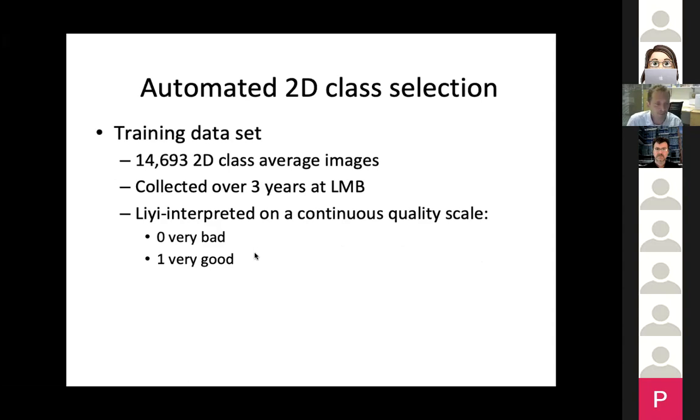Many people clicked yes, and then the 2D class averages and all the metadata from RELION Refine that led to that classification were copied to a directory that I owned. Doing so, we collected, I think, over 25,000 2D class average images.